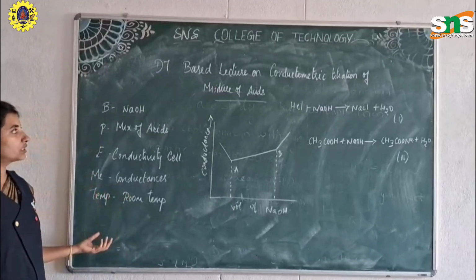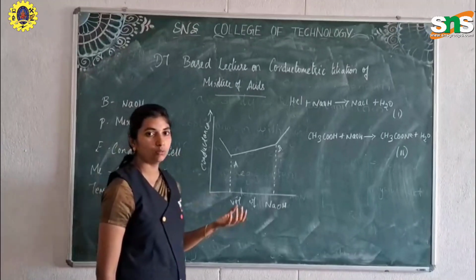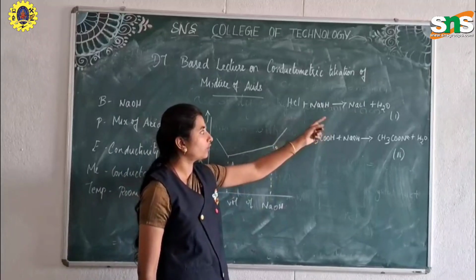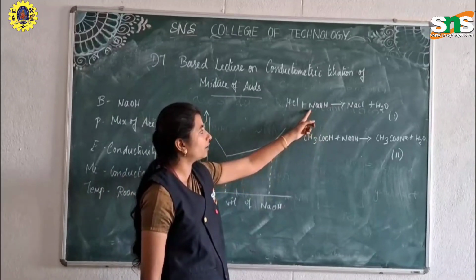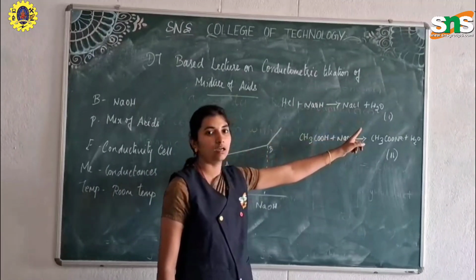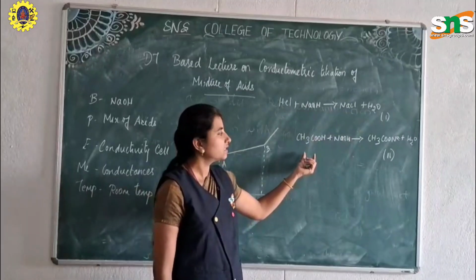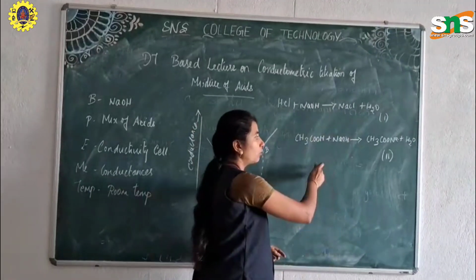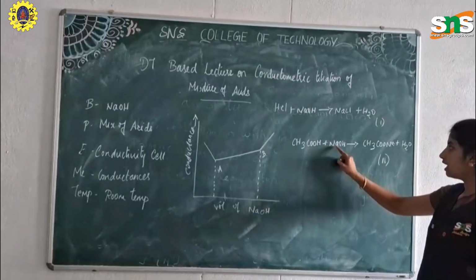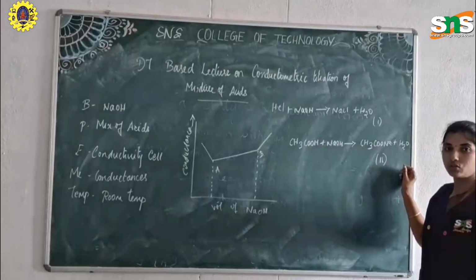The principle of this experiment is that when the mixture of acids reacts with NaOH, the HCl reacts with NaOH to form NaCl and H2O, with the liberation of water. And acetic acid, CH3COOH, plus NaOH reacts to form CH3COONa, and again water, H2O, is liberated as deionized water.